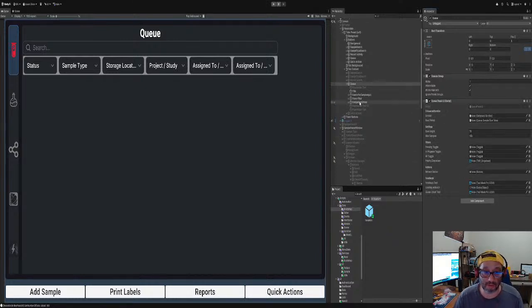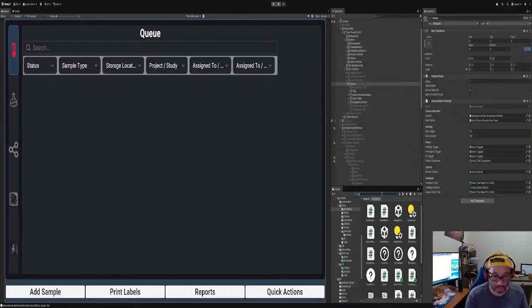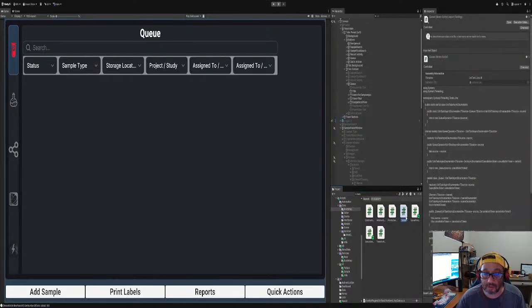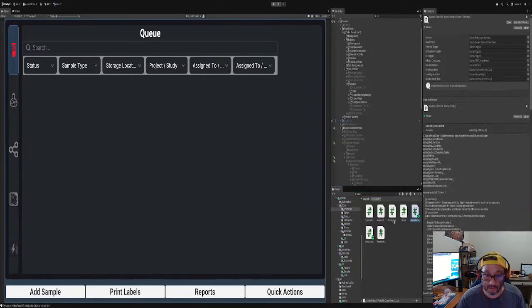All right. So now we're gonna attach the scroller to it, which is that one, and now we need to make the prefab, right? So in the prefab, you're just gonna look at the Q. That's the model. This is the panel.